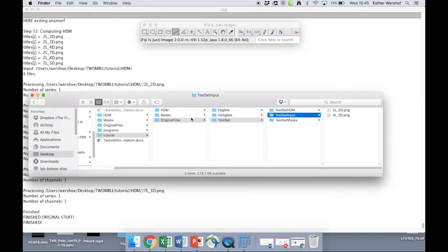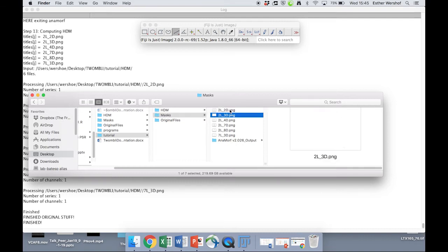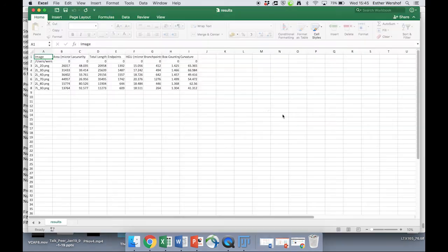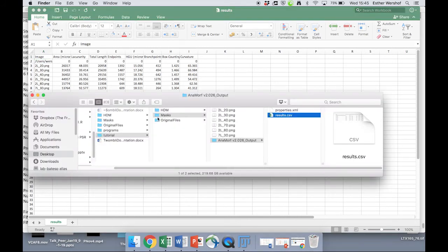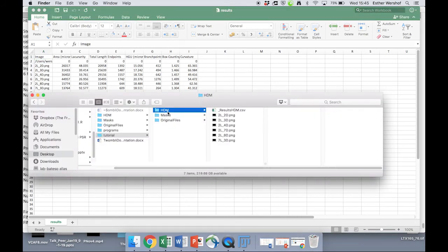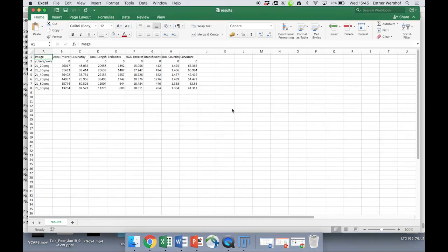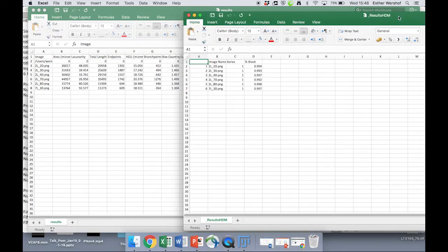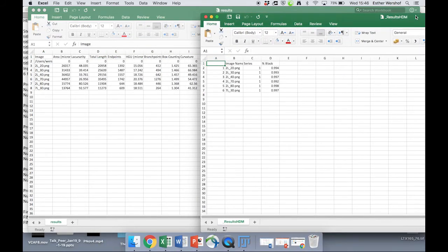So if we go back to our output, we go to the Twombly folder. We can look in the masks folder, which now is full of masks. We have some of the results inside this animal folder here. We have the HDM results inside the HDM directory. And these two CSV folders combined give us our metrics.